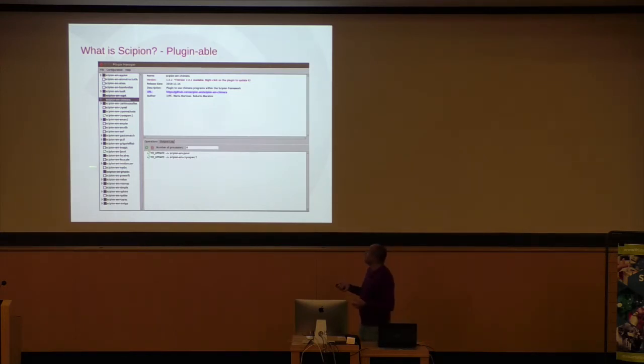This is the case for, in this case, one plugin, but don't look for it. We have removed it, and it will be inside the other plugin somewhere. Anyway, this is the flexibility we are looking for, to make your life easier to just update and install and be able to extend Scipion from the developer's point of view.